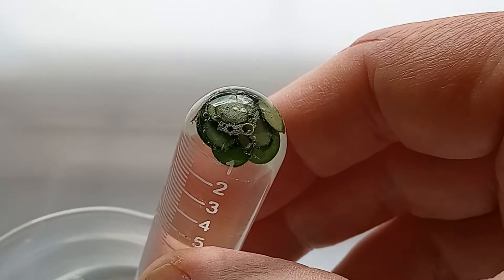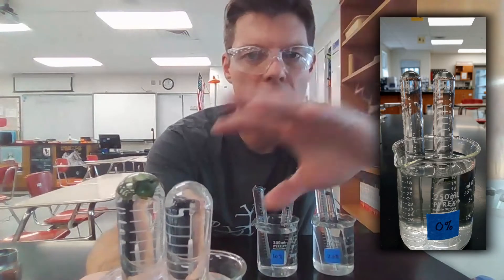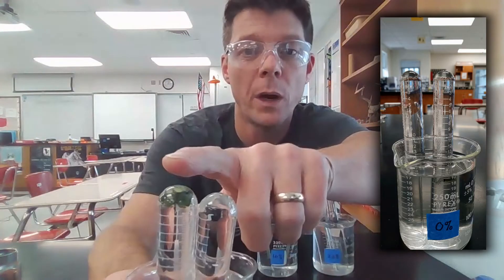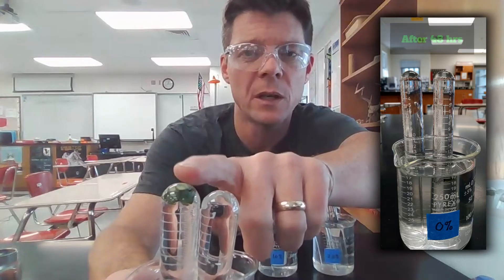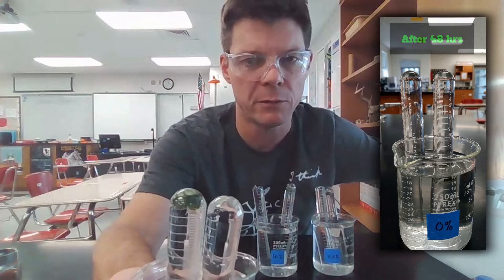The leaf disks will show evidence of oxygen production within a few minutes, but will continue to create oxygen for 24 to 48 hours. We're back with an update on the leaf disks to see how they're doing in the different solutions. They've been under the grow lights now for about 24 hours. This one, which was our negative control, has only water in it, and we can see that we aren't seeing evidence of photosynthesis taking place in the leaves that were in the water that had all of the carbon dioxide removed.